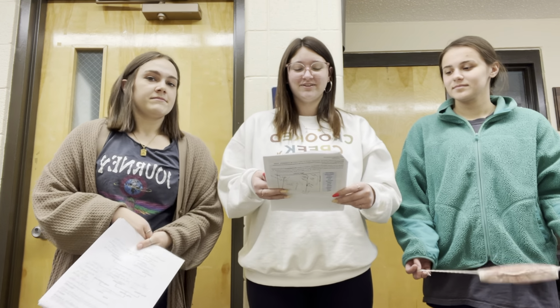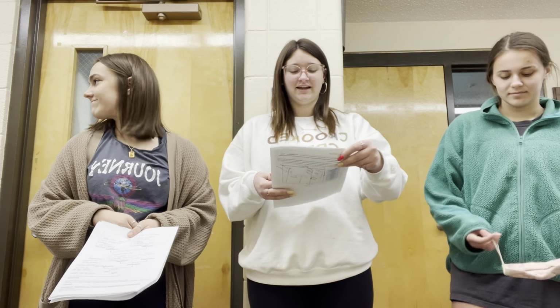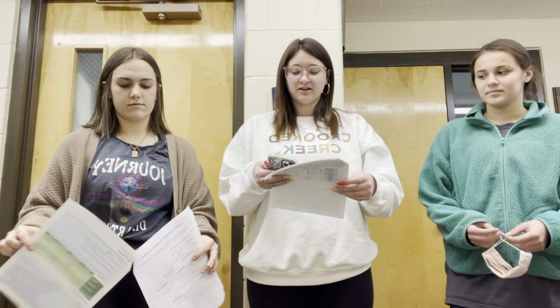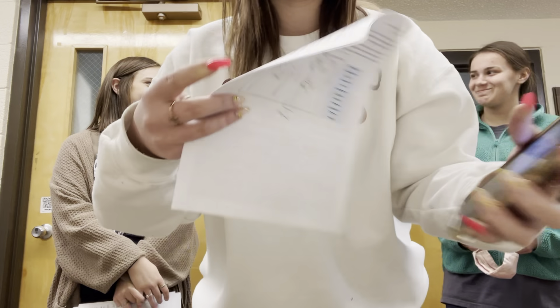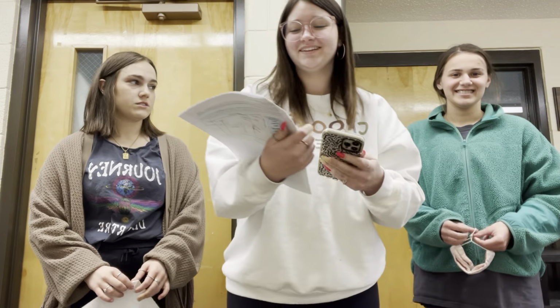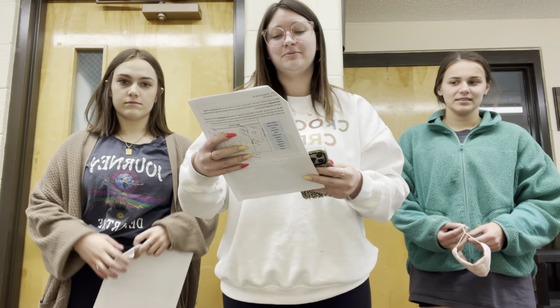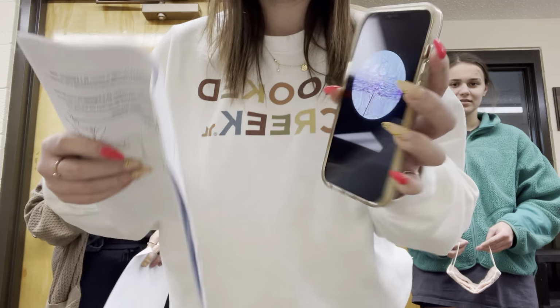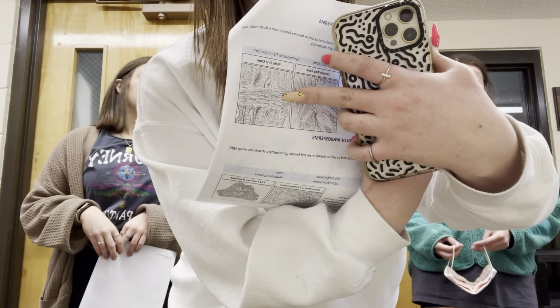All right, in our lab, we looked at four different samples in the light microscope. The first one we looked at was the female pine cone, also the gymnosperm ovulate cone, stained with lovely pink, looked just like this, and we drew it just right there. And then the next one we looked at was the male pine cone, also the gymnosperm staminate cone. Lovely staining on this one too, looks just like this, and we drew it like that.